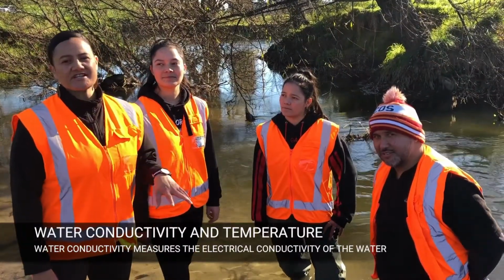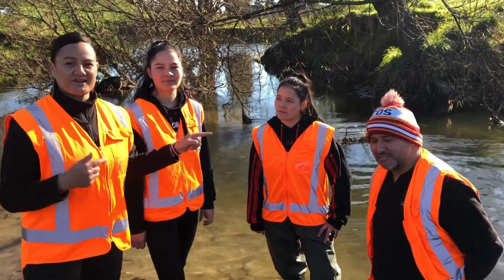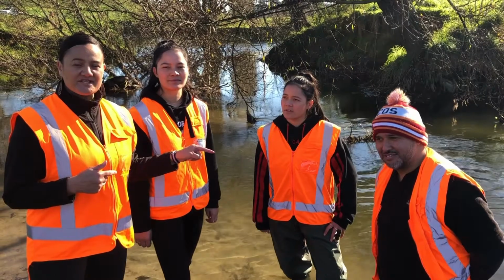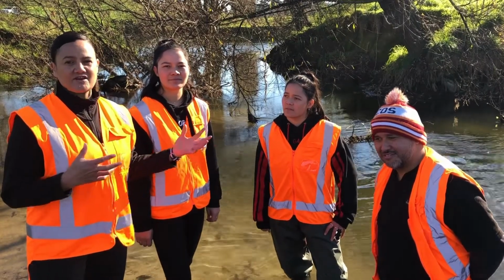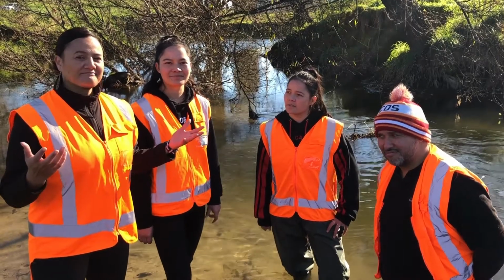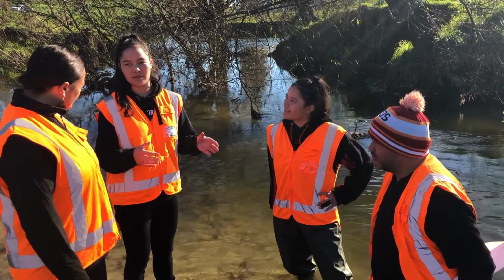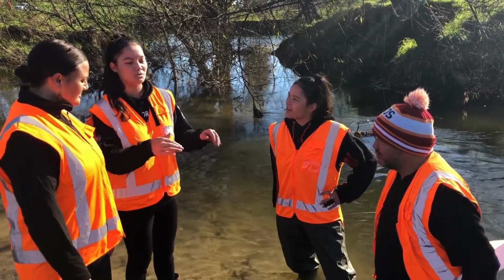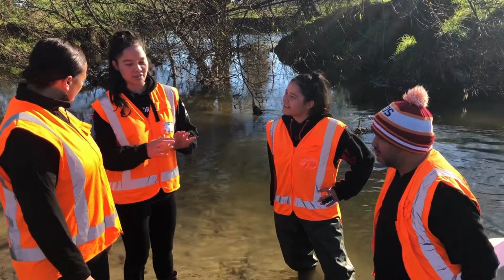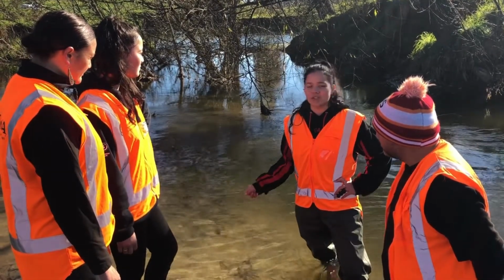We're going to measure the conductivity and temperature of the stream now. And this is the awesome thing about when your kids go to university and educate themselves, is they're currently studying this. So we're going to get them to explain what it is because they know all about it. Measuring water conductivity allows us to see how good the water is at conducting electricity. This helps determine the salinity, chemistry and density of the water. We also want to find the optimum water temperature to help the living organisms grow.